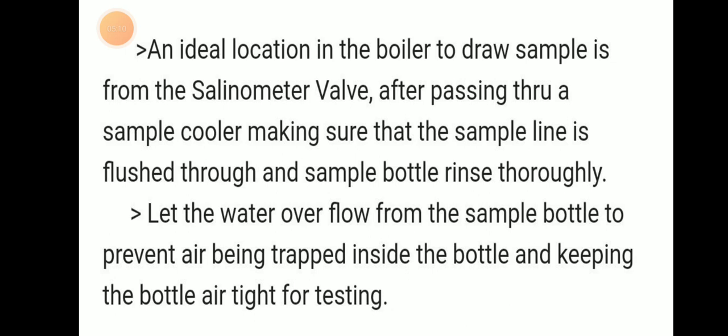After passing through the sample cooler, make sure the sample line is flushed through the sample bottle and rinsed thoroughly. Let the water overflow through the sample bottle to prevent air being trapped inside and keep the bottle airtight for testing.